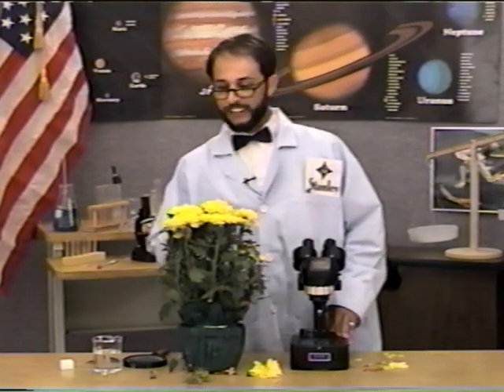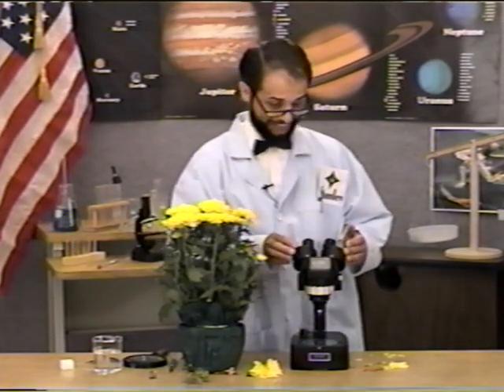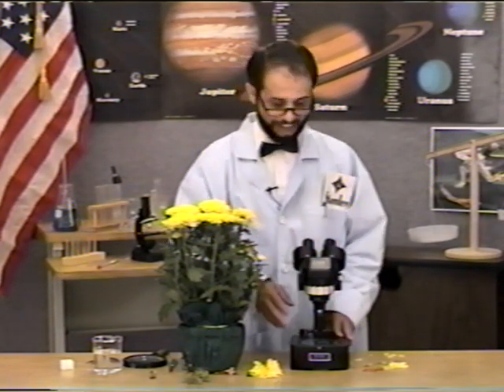Today, we're going to study one of my favorites, flowers. Most of them smell so pretty. Others just look pretty. These mums look pretty. They don't smell particularly good. Today, we'll look through a dissection scope. It's not a microscope, kind of a field dissection scope, more like a very powerful magnifying glass. And we'll try to identify the parts of several different types of flowers for you.